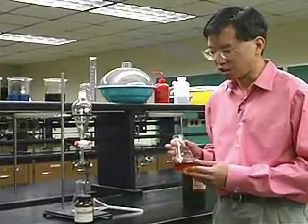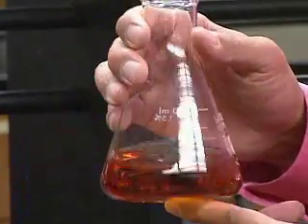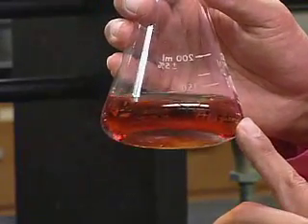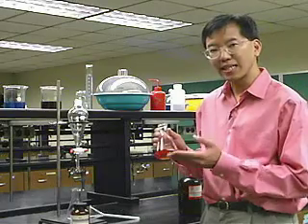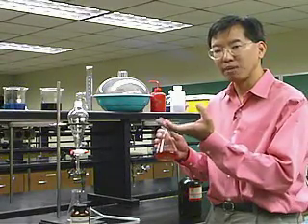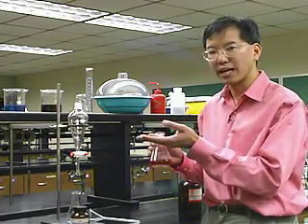Suppose you have a compound dissolved in a liquid and you want to extract the compound out — meaning separate it from the liquid. In this case, we have iodine in water. Iodine is a non-polar molecule with relatively small solubility in water. If we add hexane, the iodine will partition between the water and the hexane, since iodine being non-polar prefers the non-polar hexane layer, though not 100% — it partitions between the aqueous phase and the hexane phase.